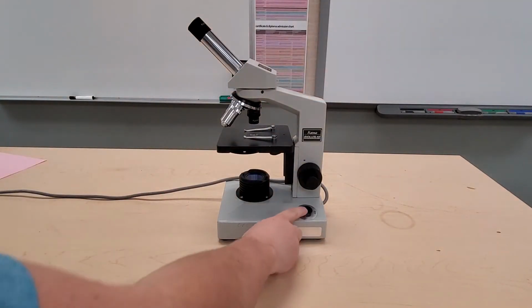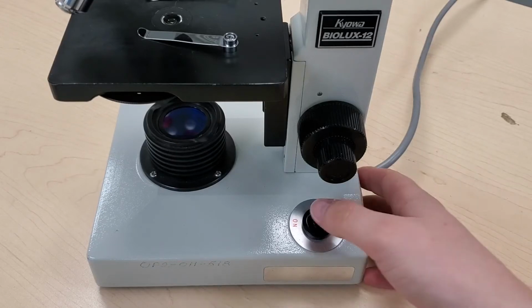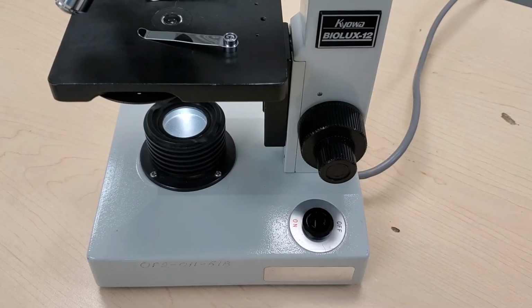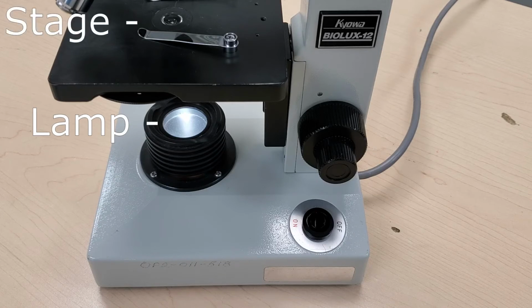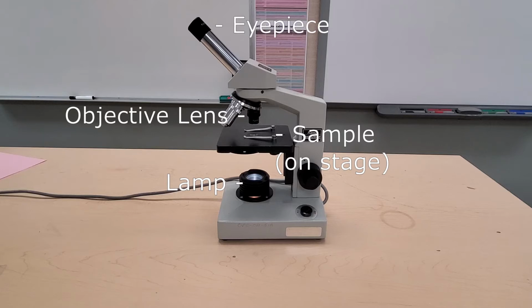When we turn it on, we can see that the power button on the side is really just a light switch. It controls whether the light or the lamp is turning on or off. So the lamp will provide light, and the light will go through the stage, and the sample sits on the stage. So the light will go through our sample into the objective lens, and then through the objective lens into the eyepiece, into our eye.